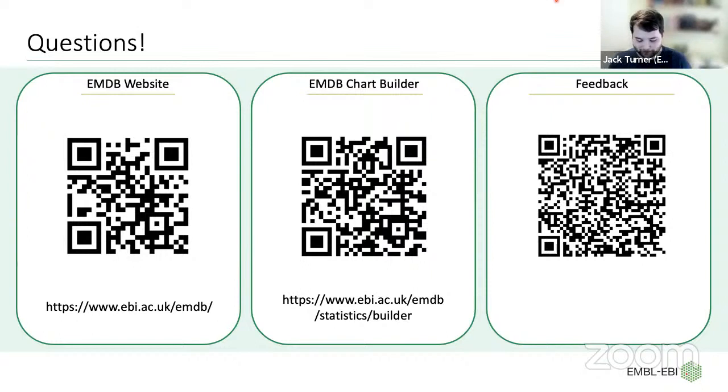That's an excellent point to bring up, and you're not the first person to bring that up in the talks I've given this year. I think this is referring specifically to EMPIAR deposition, where you have to select the data type during upload, and I have fed this back already to the EMPIAR team that this should be the type of thing that's just scraped from the header of the files.